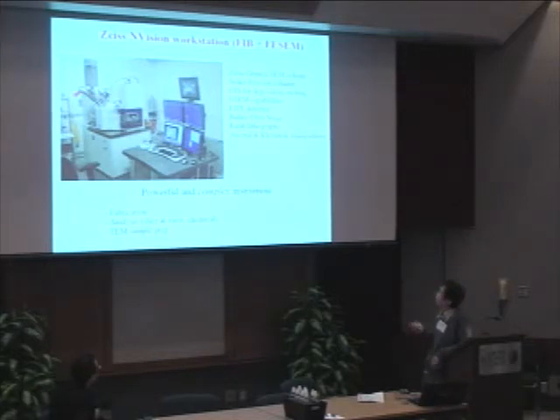There is also an EDX detector, a STEM detector, and a gas injection system, so you can do deposition locally and even make patterns with deposition. So it's a very good fabrication tool and also an analysis tool.